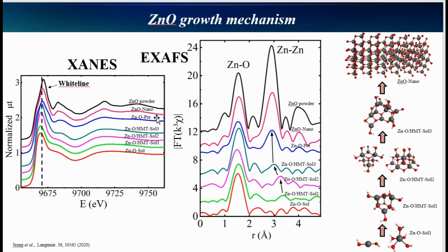Then we obtained the zinc oxide precipitate on the bottom and zinc oxide nanostructure in 1 day. The structural changes in the solutions are described by XANES and EXAFS in R space. We already analyzed the zinc oxide growth mechanism in this figure.